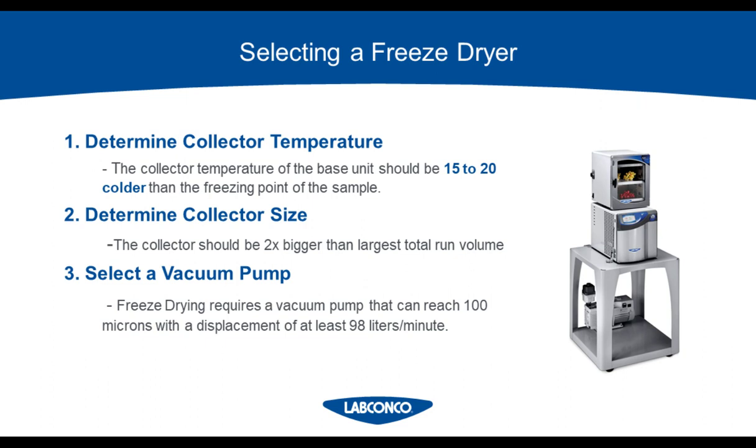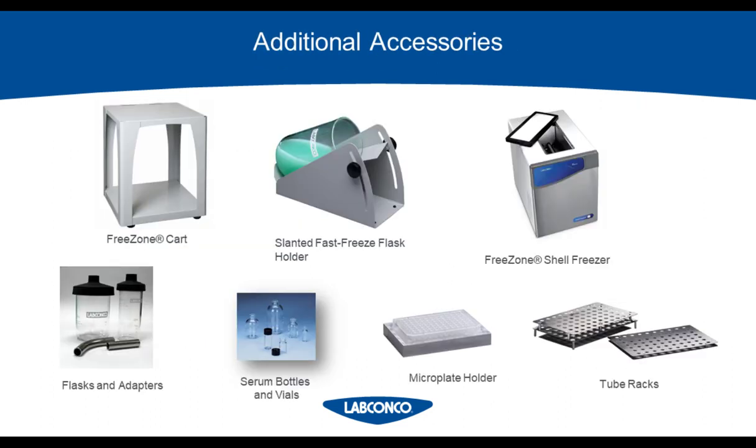The next thing you need to determine is the type of vacuum pump you need. Freeze drying requires that the pump be able to reach 100 microns with a displacement of at least 98 liters per minute.